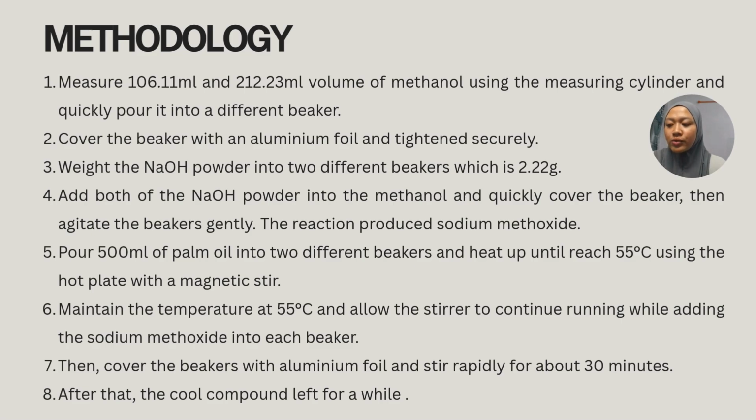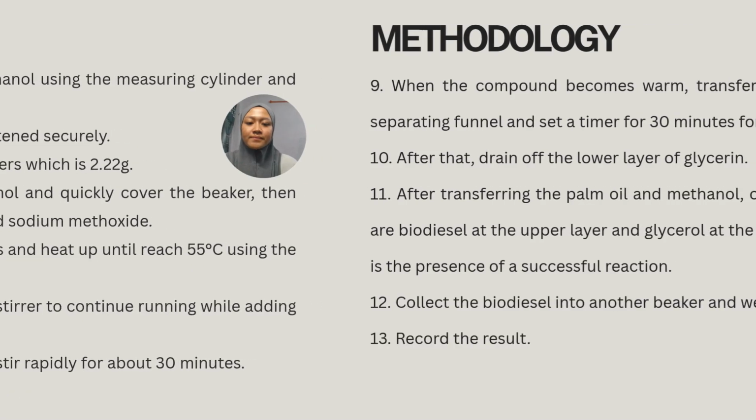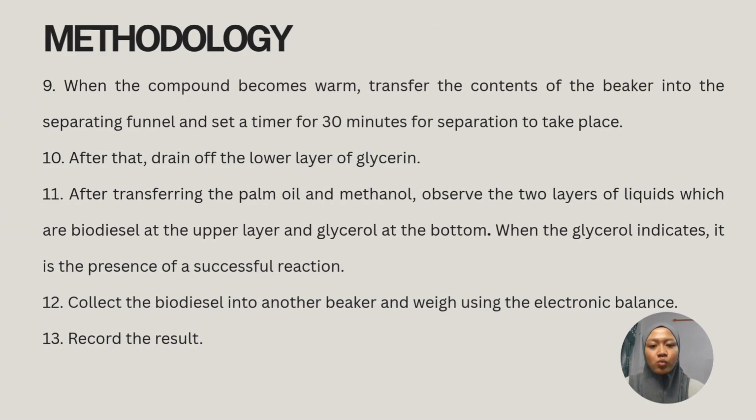Then cover the beaker with aluminum foil and stir rapidly for about 30 minutes. After that, cool the compound for a while. So when the compound becomes warm, transfer the content of the beaker into the separating funnel and set a timer for 30 minutes for separation to take place.